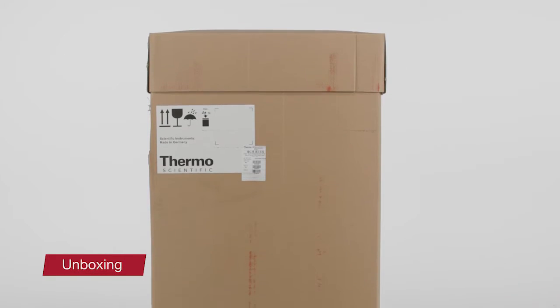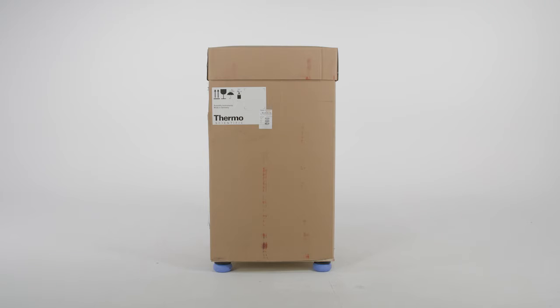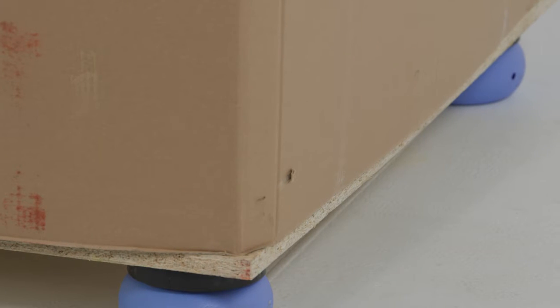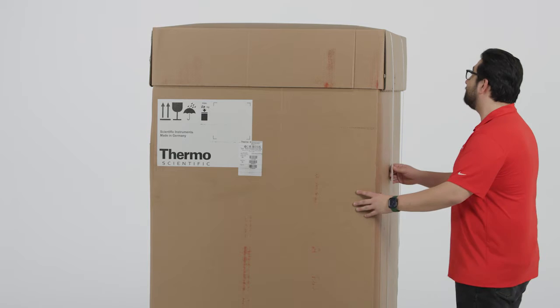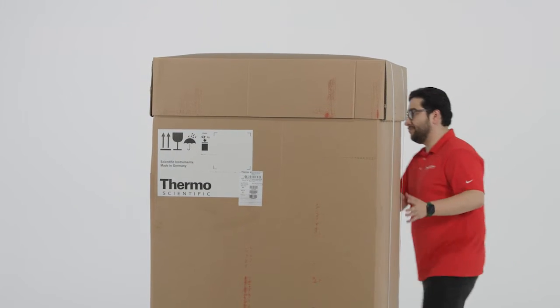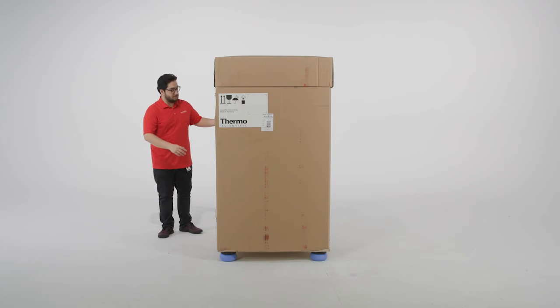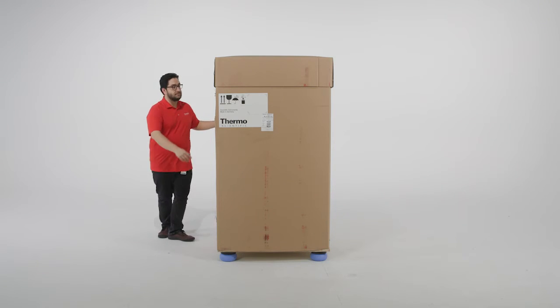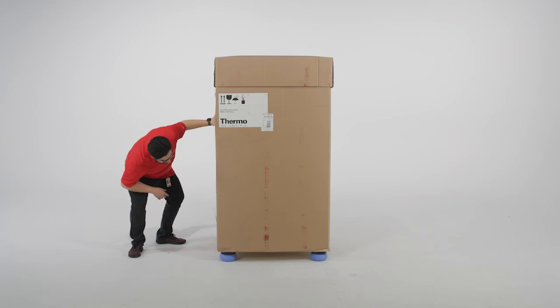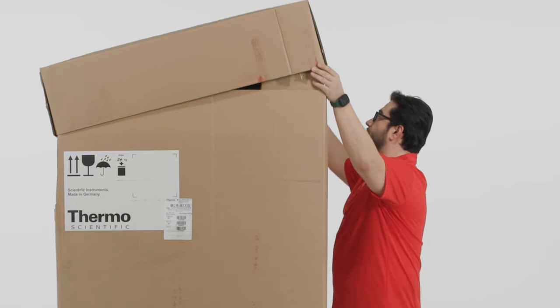The Heratherm IMP400 refrigerated incubator is delivered on a single pallet. Immediately upon delivery, inspect the shipping carton carefully for damage. If damage is noted on the incubator or the packaging — in particular damage caused by humidity or water — notify the shipping carrier and Thermo Fisher Scientific Technical Support. All packaging material can be separated and are reusable.